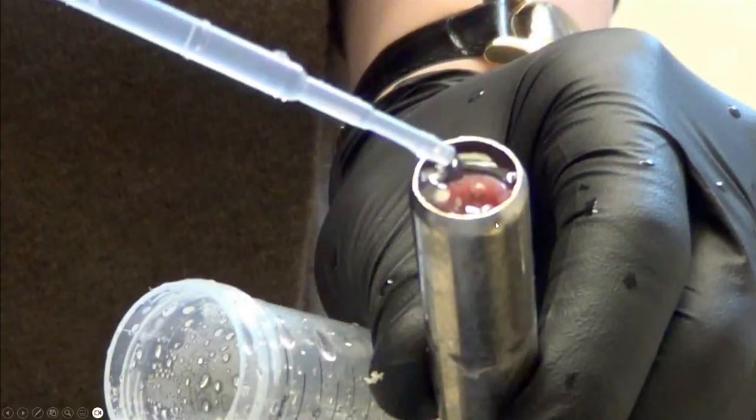So we will then slide the stainless steel sleeve over the Teflon cylinder, to an extent that it covers the top of the tissue. Then we take some of our agar that is still in the water bath, which we have left over from inflating the lung, and cover the tissue with it and allow it to solidify.